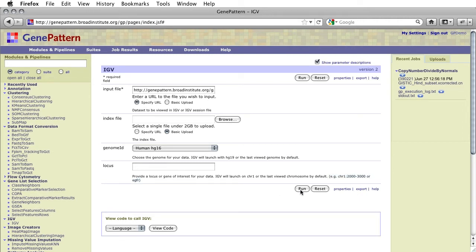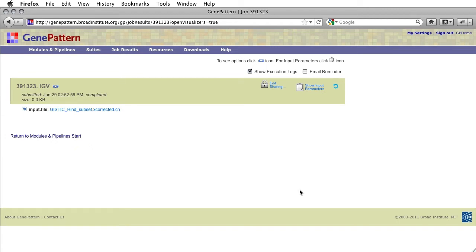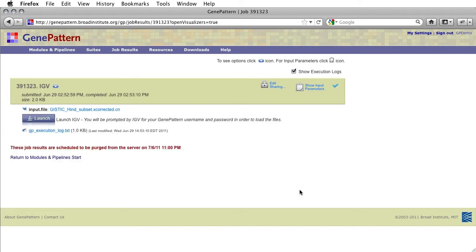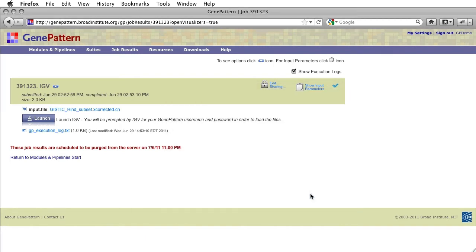Once we've finished our selections, we can run the module. When the module has finished processing, a launch button will appear. Click this to launch IGV with your data and parameters loaded. You may be presented with a security warning from your browser. If this occurs, simply click OK, Run, or Yes to allow IGV to continue. You may also choose not to see this message again.